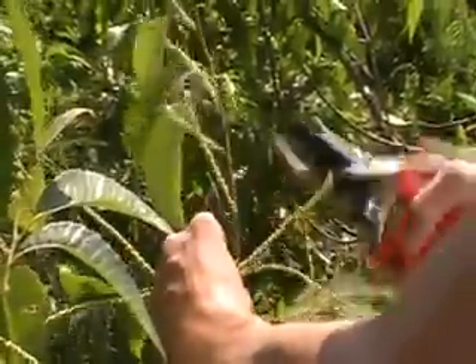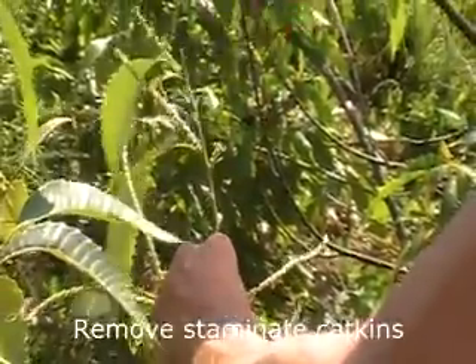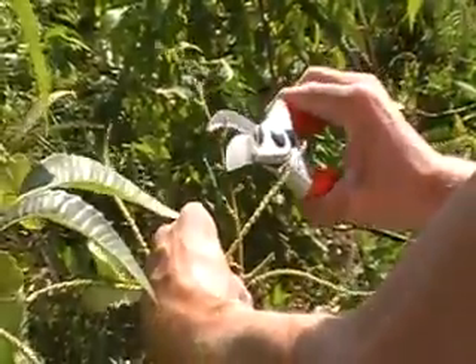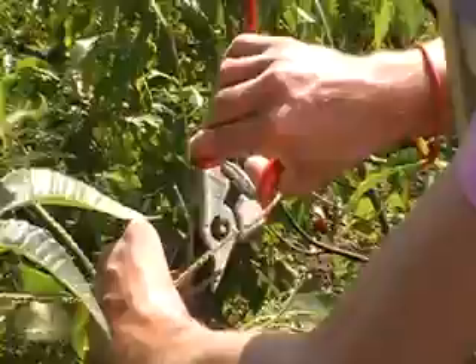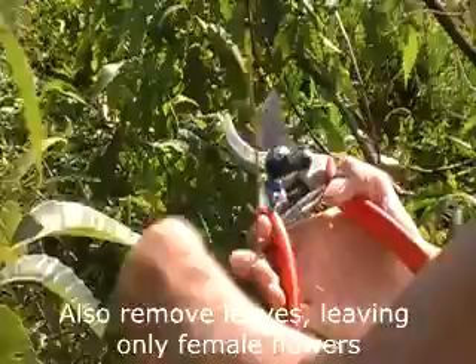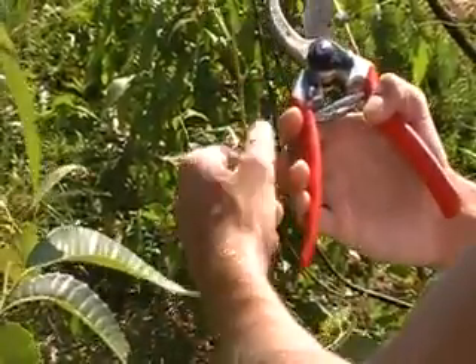To remove the male catkins and the male portion of the bisexual catkins, we can use tiny scissors, or they can sometimes be pinched off with the fingers or fingernails if you're careful about it. Afterwards, we put a bag over the unpollinated female flowers to ensure that there's no accidental pollination.